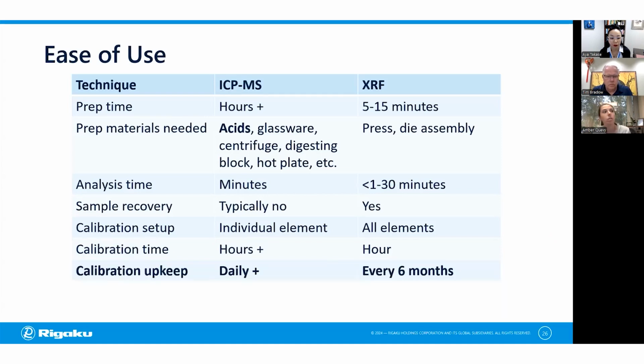Calibration upkeep. This is a common complaint that I hear when talking with individuals that are working between the two techniques: calibrating that instrument. It's going to take daily plus, I say, if you're having any humidity or temperature changes in the lab that you're having to accommodate any changes to the instrument. Calibration is very touchy in some cases.